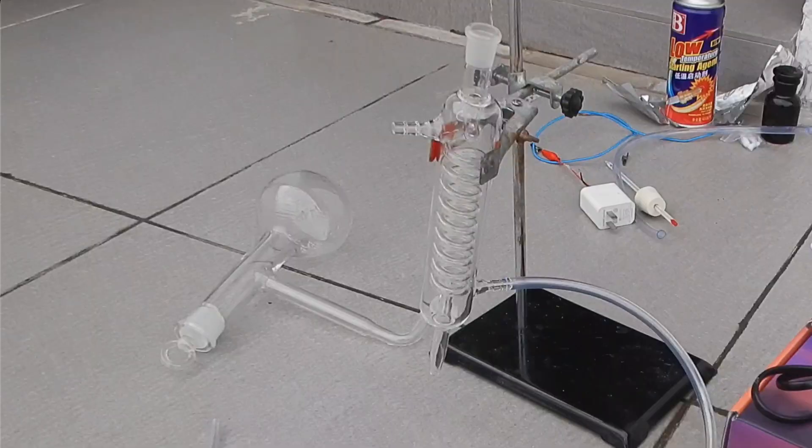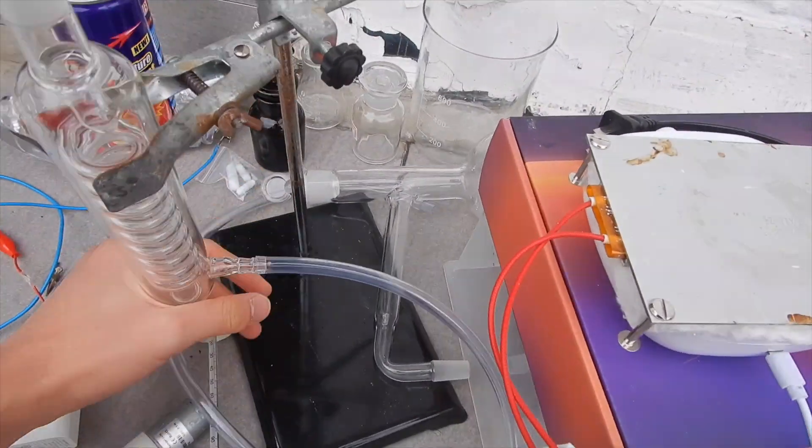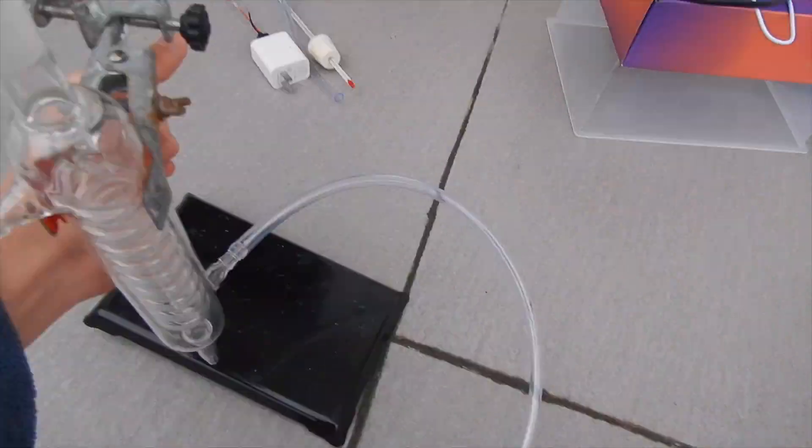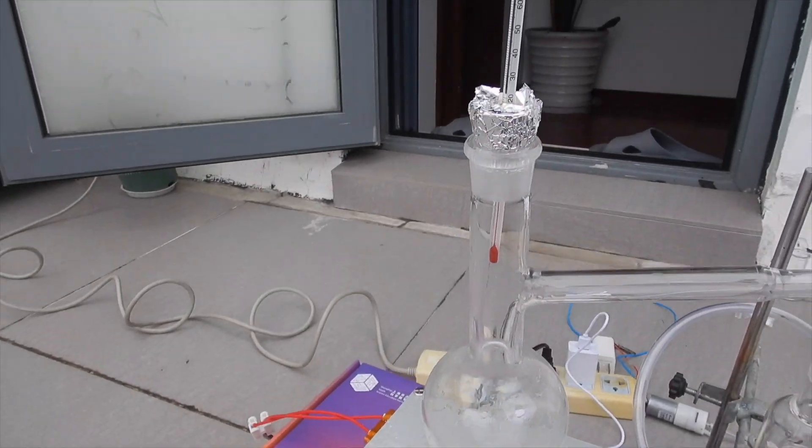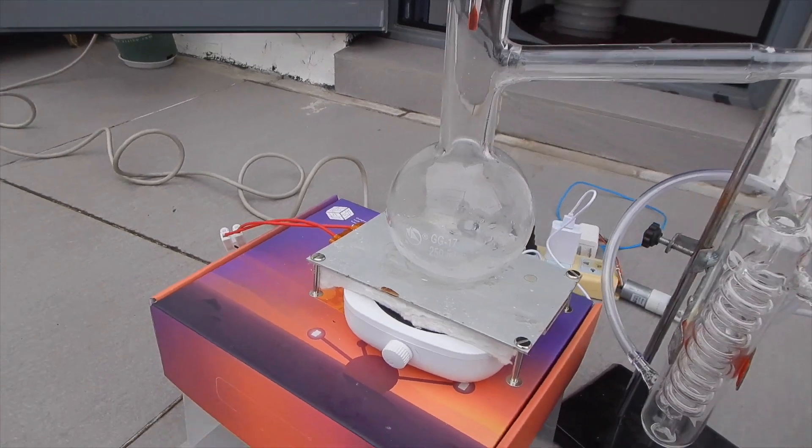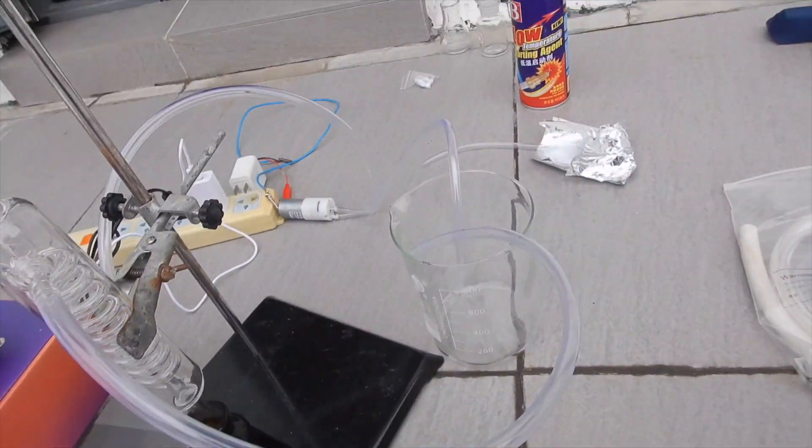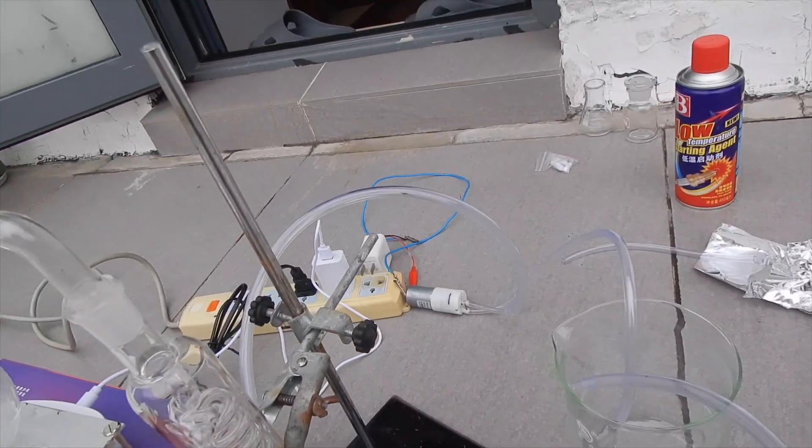We also need a distillation apparatus, and I used the all glass setup I just bought recently. I moved outside and constructed my apparatus piece by piece. Here is a shot of everything we will need. I first put the hotplate on a few stacked boxes, and put the magnetic stirrer under it. Then, the distillation apparatus is installed above the hotplate.